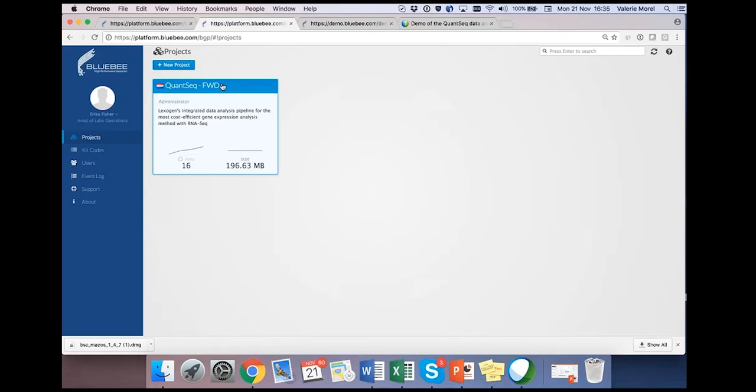Maybe you have mentioned this before. If I use multiple barcodes corresponding to one sample, how can I specifically define this in the analysis settings? So far, you cannot. You can either run the pipelines for the replicates and afterwards combine them.